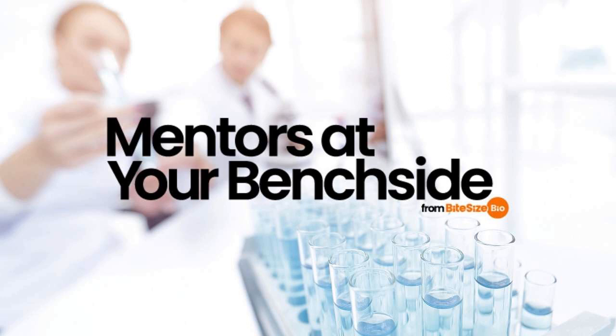In particular, 32 phosphorus is a nasty isotope as they go. It's a high energy beta emitter with a short half-life. Or in English, it can put a lot of energy into your tissue and do so quite quickly. And hydrazine is a potent neurotoxin that can cause organ damage. The less of that used, the better.